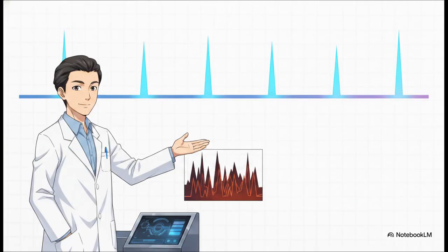The real takeaway here is that, yeah, a carbon-13 experiment might take a lot longer to run just to get a decent signal-to-noise ratio, but that massive 220 ppm spectral window is incredibly forgiving. It spreads all those signals way out, preventing the peaks from bunching up on top of each other. The result is a spectrum that's vastly cleaner and way more distinct than your typical hydrogen mapping.